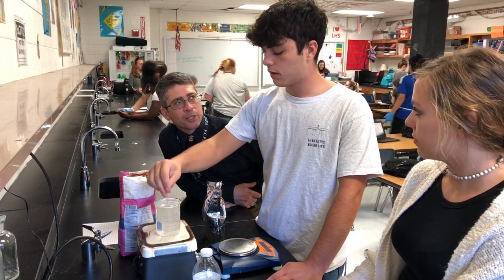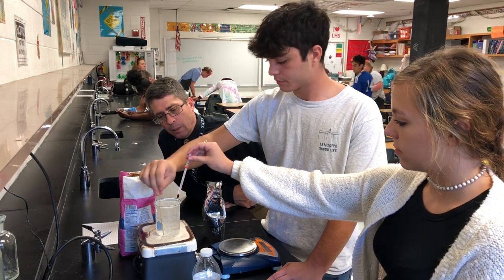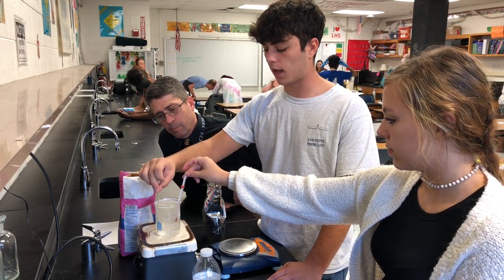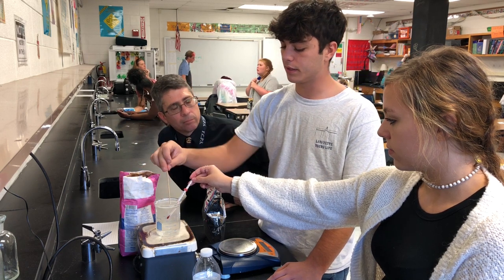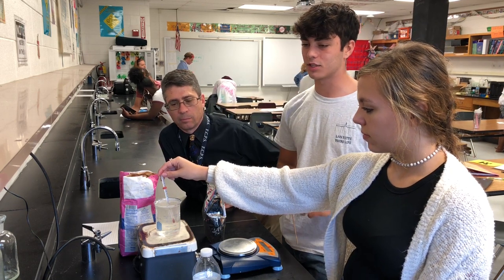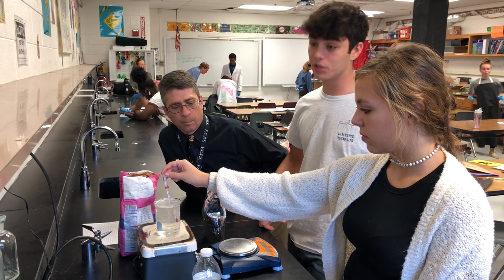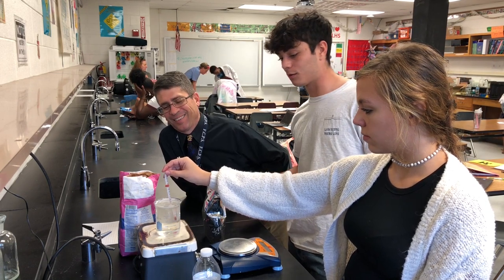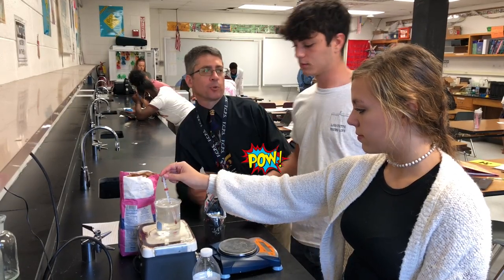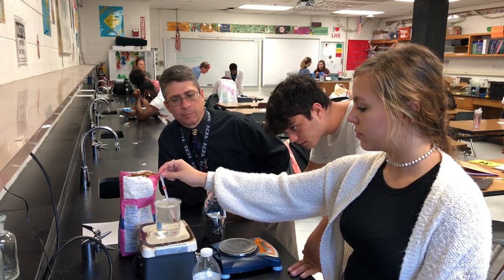Okay. Cal, what do you think you learned from this lab? Although you were absent, now we're in the middle of it. And so what are you getting out of the lab? For the most part, I feel like it's important to realize that this is a basic lab and it's really important because you can set up your lab notebook with it. And with the lab notebook, it shows you the real importance of doing science, especially outside of school, because you can get sued for doing things incorrectly. So as long as you record everything, you know where you went wrong. So following the correct procedures and keeping track of your data, this is the lab that really supports that.